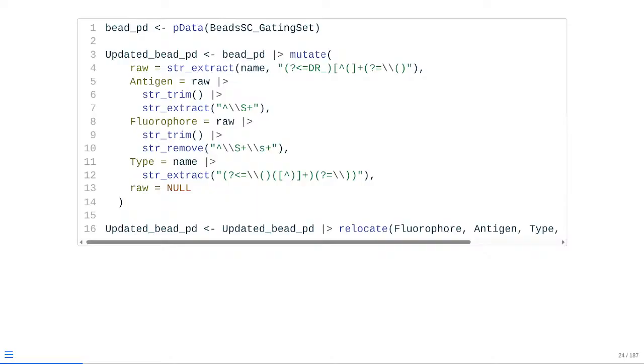As we were covering back last week of the class, you can do this using a large language model, an LLM, so ChatGPT, Claude, whichever your AI go-to would be. And you can ask it a very specific question of, I have this particular file name I'm working with in R, I'm trying to grab these specific portions and do it consistently across multiple names. And it will spit back this kind of code here that you can use to actually extract it out.